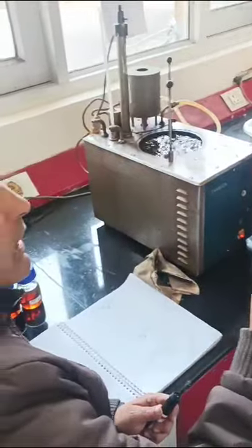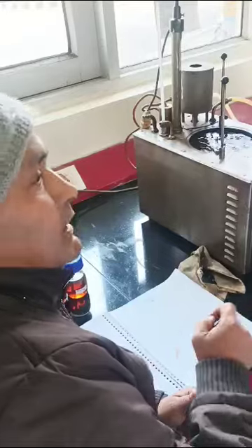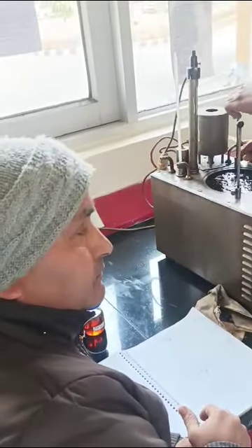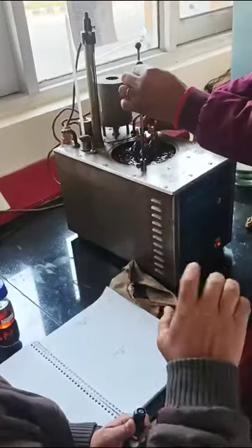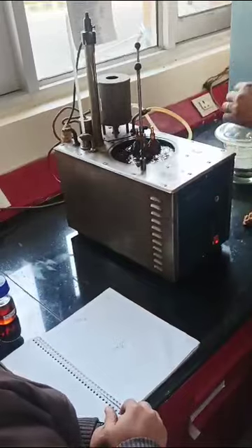When you mix aniline, that sample and normal heptane, you will find layers. You will have to heat up to find at which temperature it mixes all together, or separates from each other. The difference between mixing and separating should not be more than 0.3 degree centigrade. That will be your aniline point.